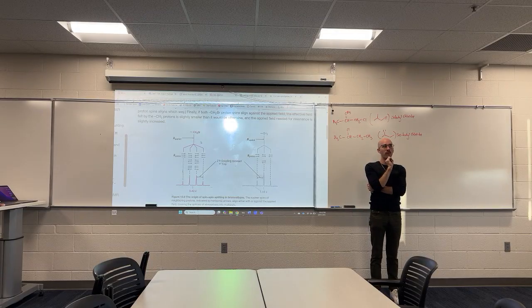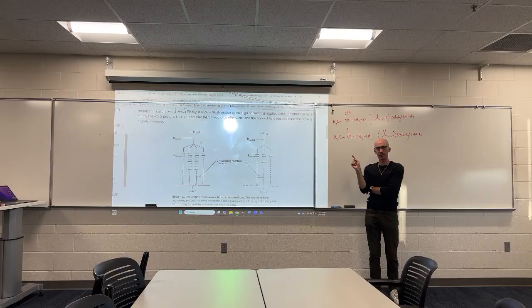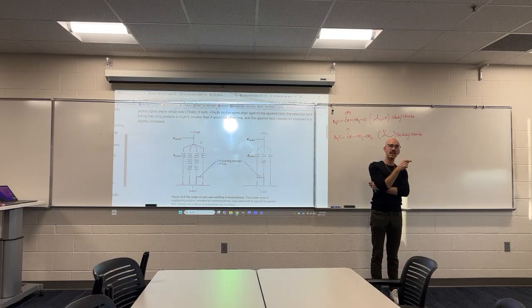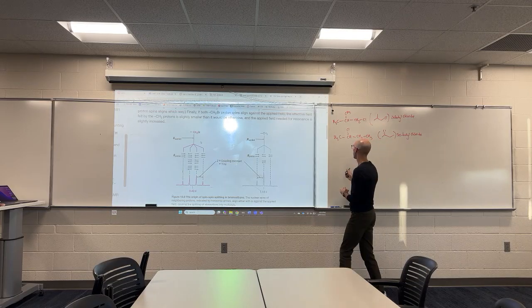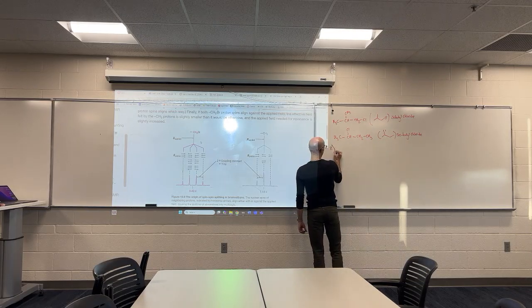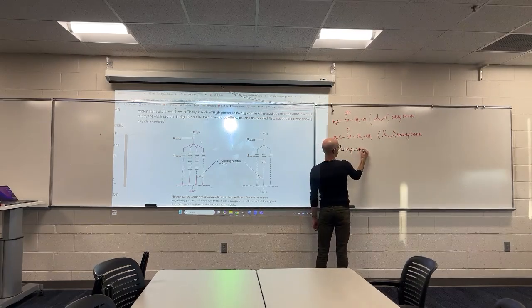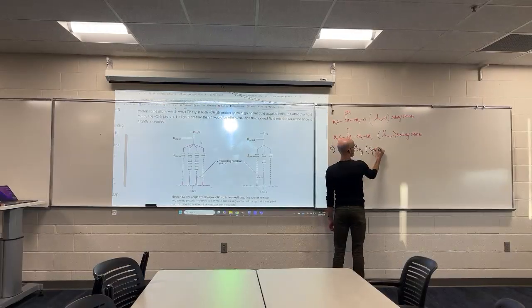It turns out that when they get aligned, they often have these combinations of alignments. And the way that hydrogens on one carbon align can actually impact the way that neighboring hydrogens experience the magnetic field. So here we're getting into point 3, which is called multiplicity, also called splitting pattern.